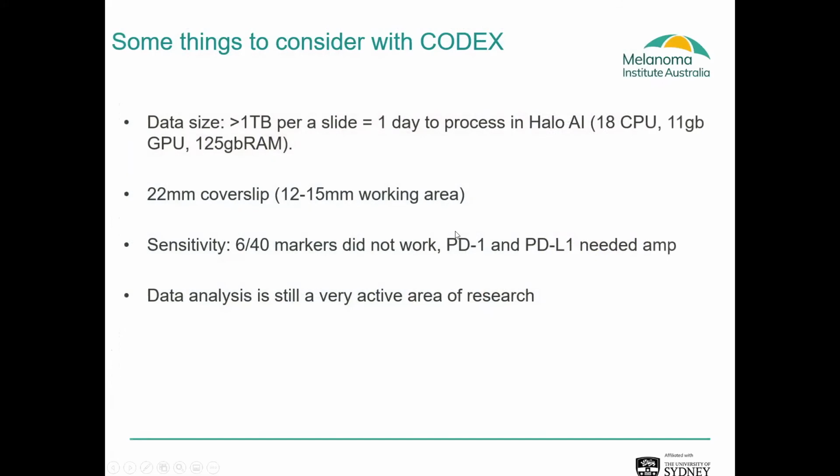At this stage, it's a work in progress. Cam's been developing multiple different methods to analyse the data downstream, but we're happy with the images we're getting and the type of data. It's just a matter of developing the pipeline to analyse them. Some things to consider when working with the Codex that we've learned from our experience so far is the data size is big. It can get up to 1 terabyte per slide. So it's something that needs to be considered if you're going to undertake this type of analysis.